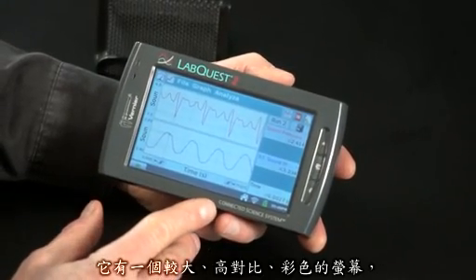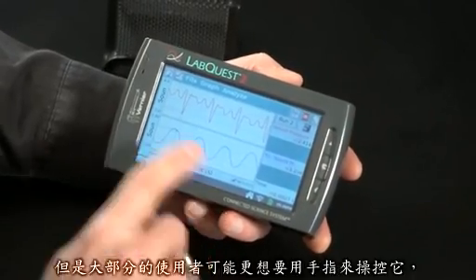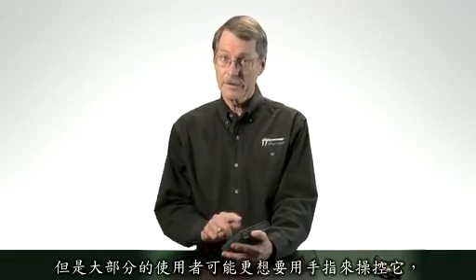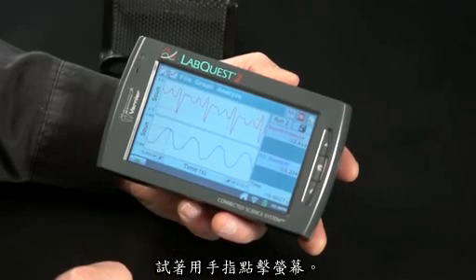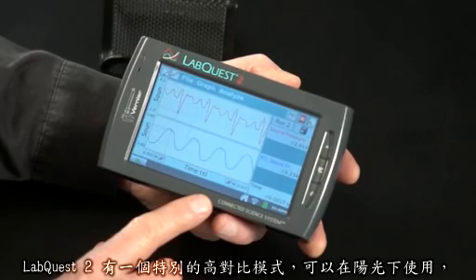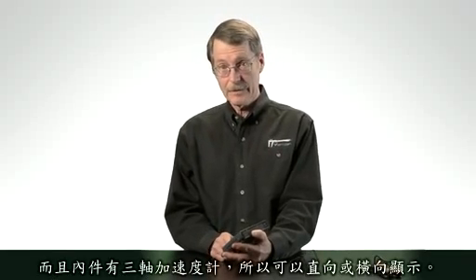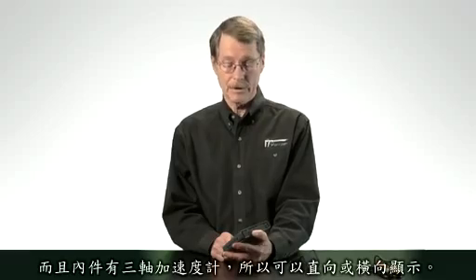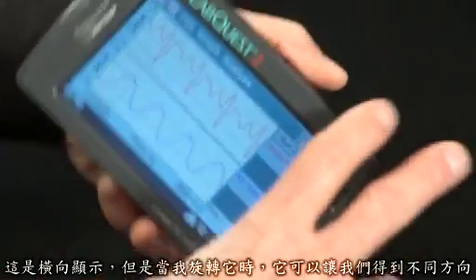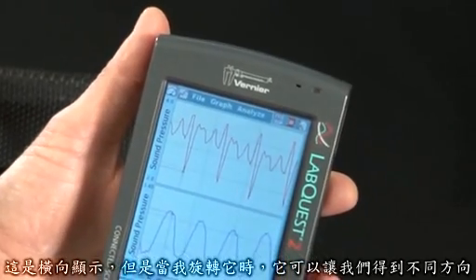It has a large, high-contrast color screen, and it comes with a stylus. It can be operated with a stylus, but most people will use their finger and just tap the screen. LabQuest 2 has a special high-contrast mode for use in the sun, and it has an accelerometer so it can be used in portrait or landscape mode. Here is landscape, but if I rotate, it picks up on that and we get a different orientation.